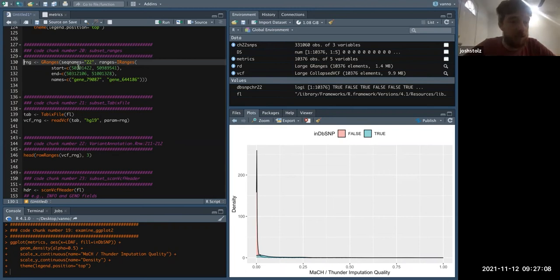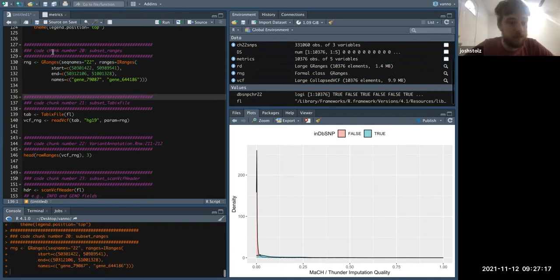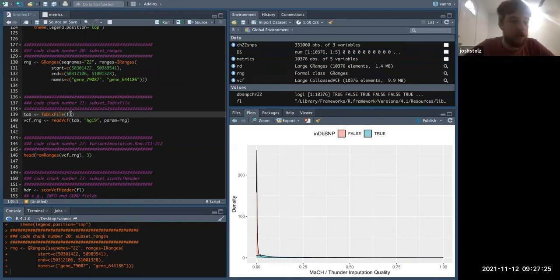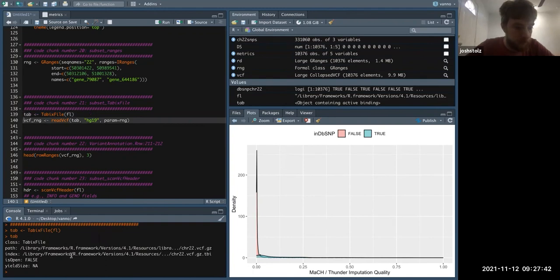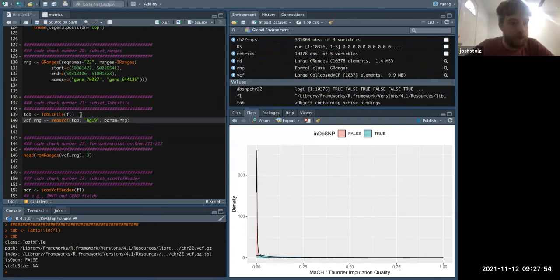We get our range here — chromosome 22, start, end — and we're looking for two specific genes. Originally when we read this in it had a path; if we look at FL it has an accompanying path to a tabix file. This indexes our VCF by rows. Now when we read this in, we can specify the tabix file, the build, and our ranges, and we get a specific subset of the VCF.